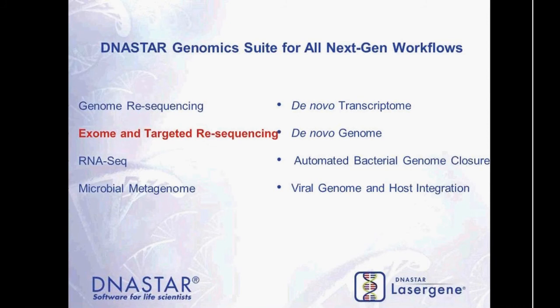So after you're all set up on either the desktop or the cloud, the Lasergene Genomics Suite supports a wide variety of different workflows. Today, we'll be focusing on some of its exome sequencing capabilities, but as you can see, we do offer support for many different data types, assemblies, and alignment workflows.